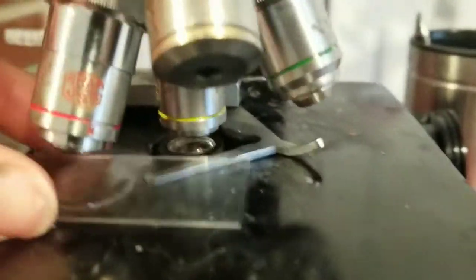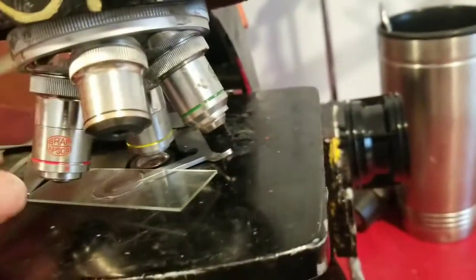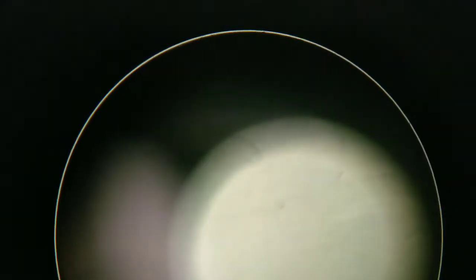Now I'm going to show you this under the microscope. As you can see, there are a bunch of little dots, and these little dots are the bacteria at 650x magnification.